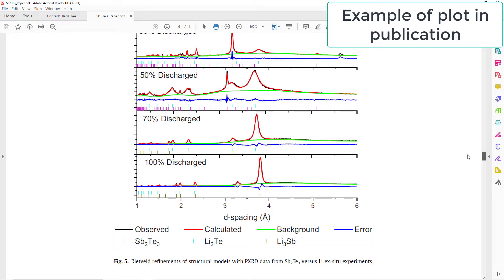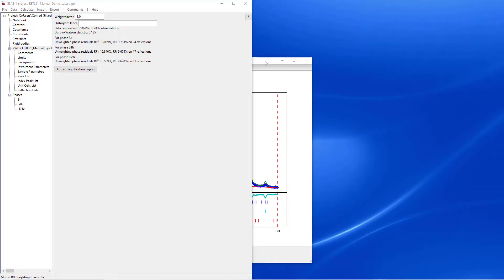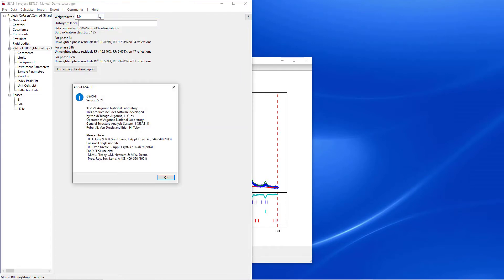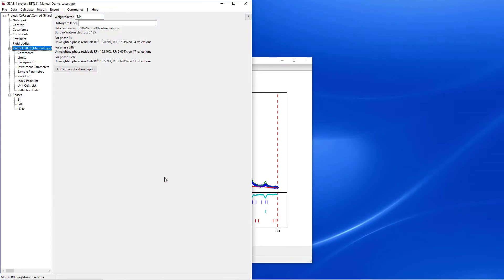Therefore, I added a feature to GSAS2 enabling plots to be directly exported to Origin. In order to use this feature, users must first ensure they are using version 5023 or later.